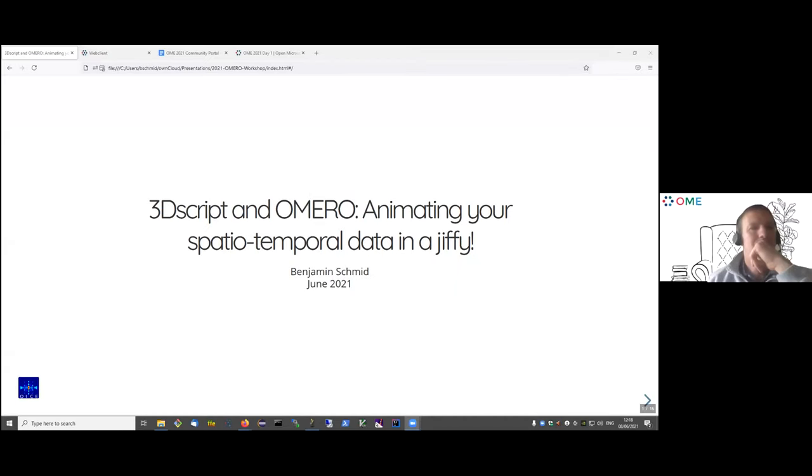Yes, perfect. So what I would like to show you in the next couple of minutes is OMERO's 3Dscript, which is a new software to marry OMERO and 3Dscript. It's implemented as an OMERO web app to directly create 3D animations on the OMERO server. And the good news is that it should be as easy as ordering a pizza, as you will see in a second. And the best thing about it is that you don't even need a high-end graphics workstation for it, but it should also work on your mobile phone, at least if you're the end user.